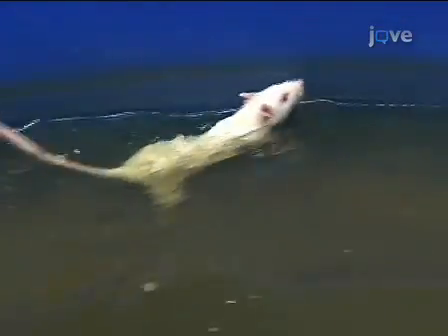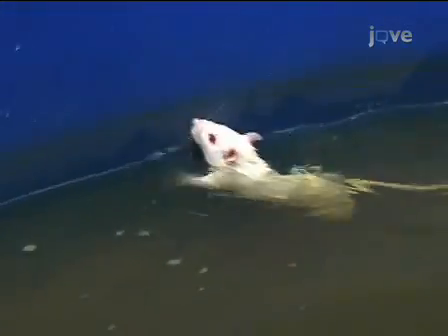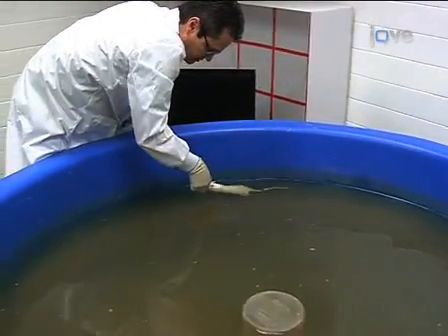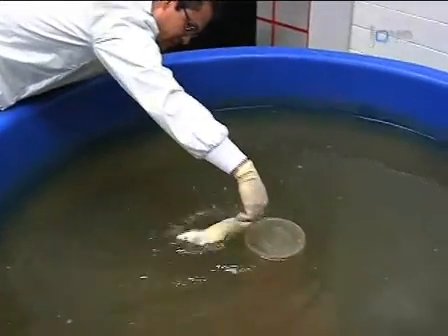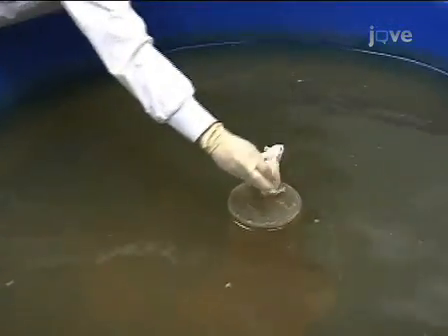Let the animal swim around for a maximum of 60 seconds. At first, the animal may swim around the edges of the pool looking for a way out. Eventually, the animal will reach the platform and climb up. Once the rodent reaches the platform, stop the timer and record the time. If it doesn't find the platform in 60 seconds, record the time for the trial as one minute. Do not pick up the animal if it fails to reach the platform — rather, gently guide the animal to the platform with your hand. Let the animal sit for 15 seconds. If it falls or jumps off, gently guide it back. This will train the animal that it must stay on the platform to be rescued from the pool.